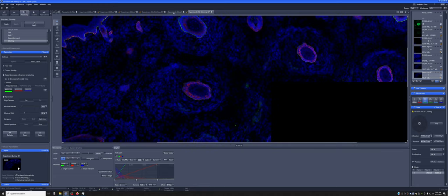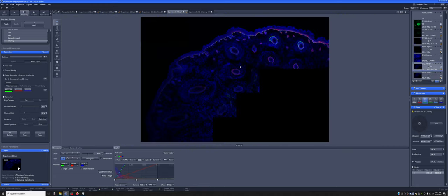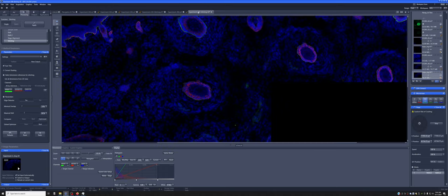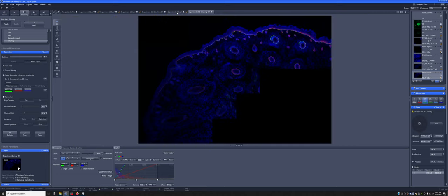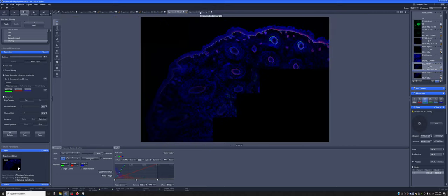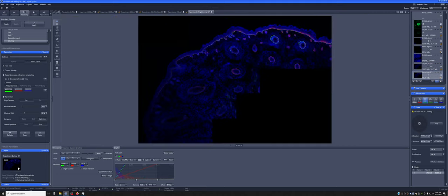One note is the image without the stitching sometimes looks smoother. And when you go to this one, it looks, even at the same scale, it looks a little bit noisier. That's completely an artifact of the display.